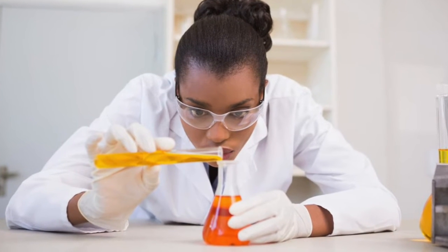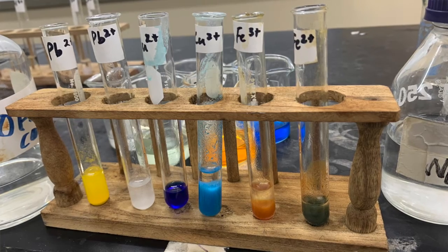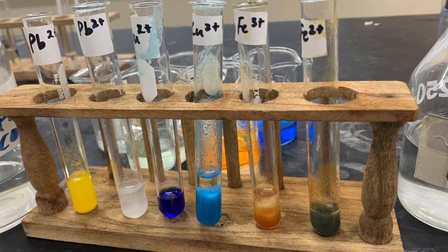Now in this video, we'll be looking at Forensic Chemistry 101 or Qualitative Analysis. We will be looking at how to identify some metal ions and some anions in solutions, as well as how to identify some common gases.